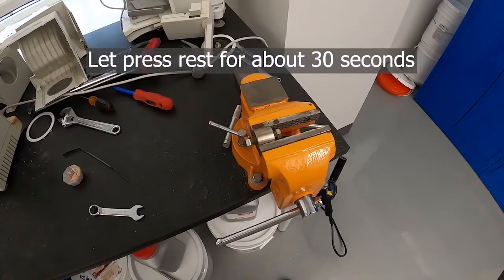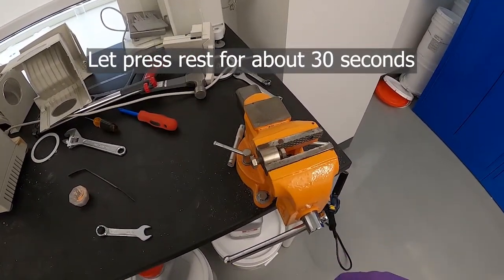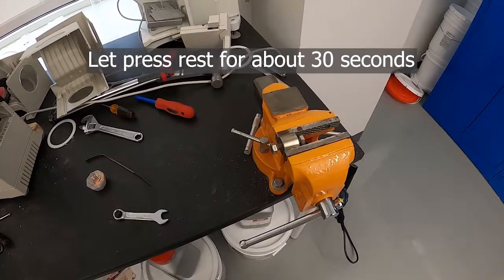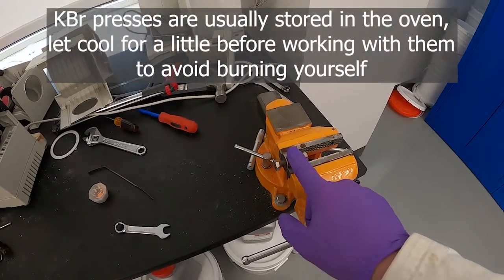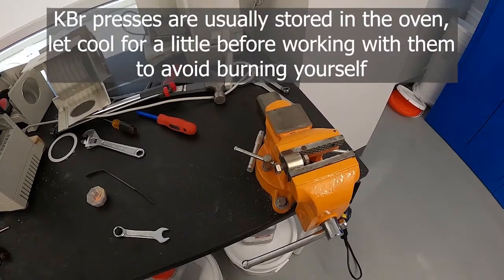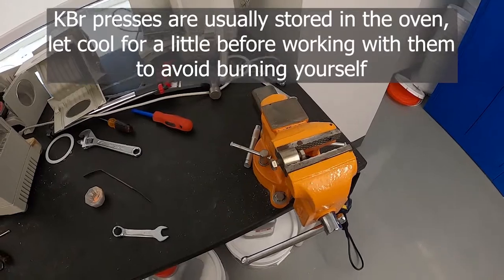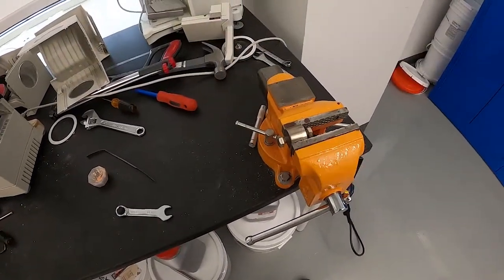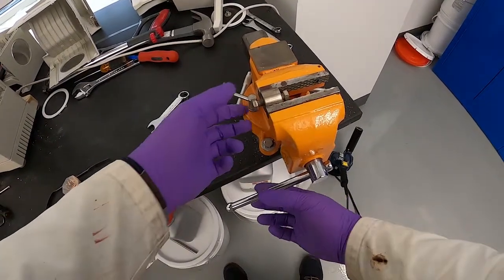We'll let that press for a minute before we carefully loosen it to see if we've got a nice glass pellet. The presses when stored are usually kept in the oven to keep water from sticking to them. It's important to let them cool down before use, otherwise it'll be too hot to touch and you won't be able to do this step. We've let that sit for a few minutes now.